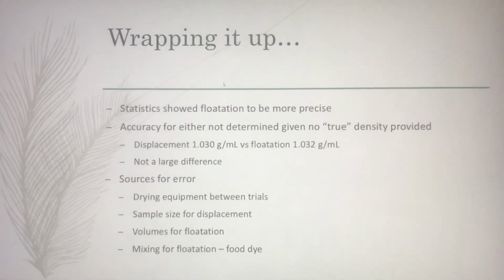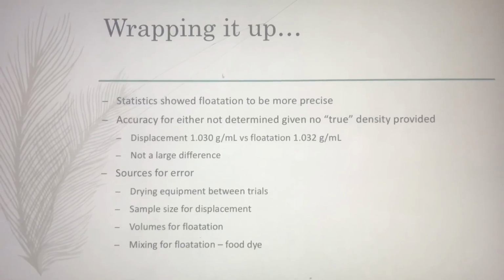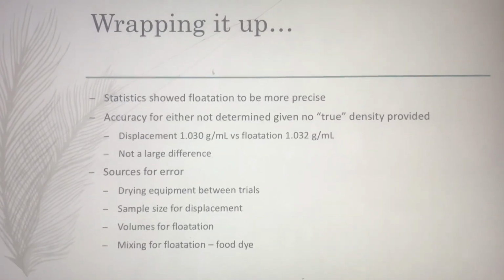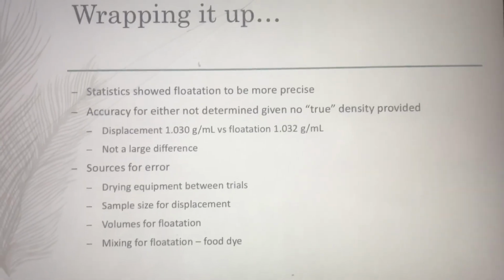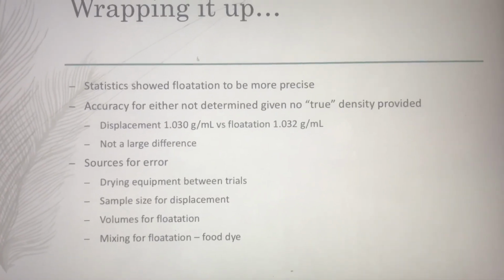So to make the flotation method a little easier and simpler to monitor in terms of whether you're getting a good even mix, I think you could probably color the water, or color the water and the glycerin, just to use that as a barometer of whether you're getting it mixed accurately.